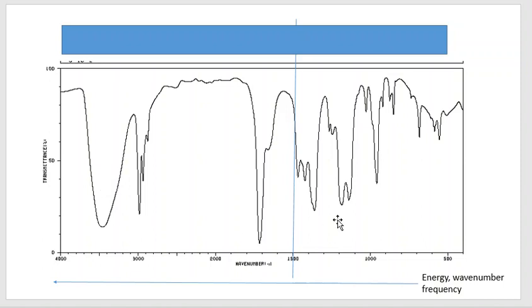And this is just one molecule here, and you can see that it absorbs in lots of different places. That's because every molecule has lots of different vibrational states. It's going to have a bunch of different bends, and a bunch of different stretches. The more complicated the molecule is, the more of those it will have. So you can see in this case that this molecule has a whole bunch of these bands or absorbances.